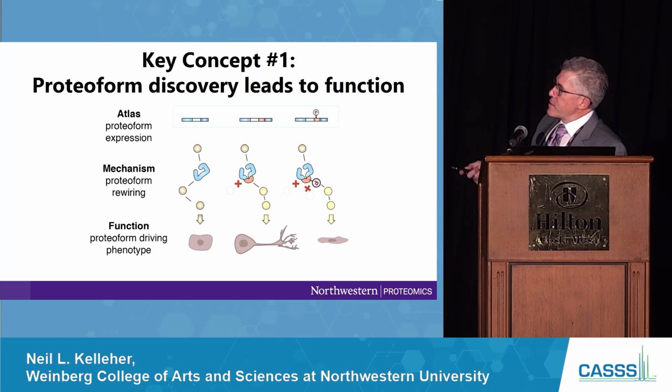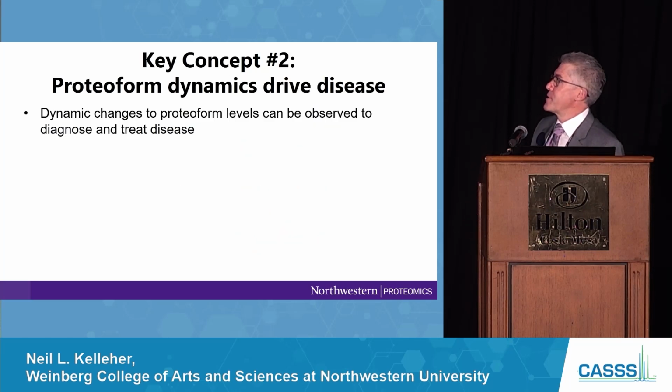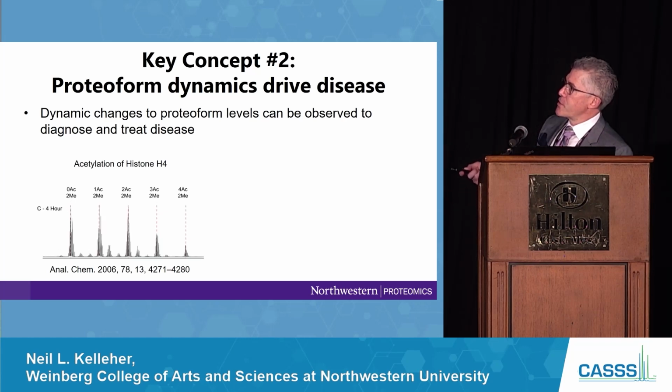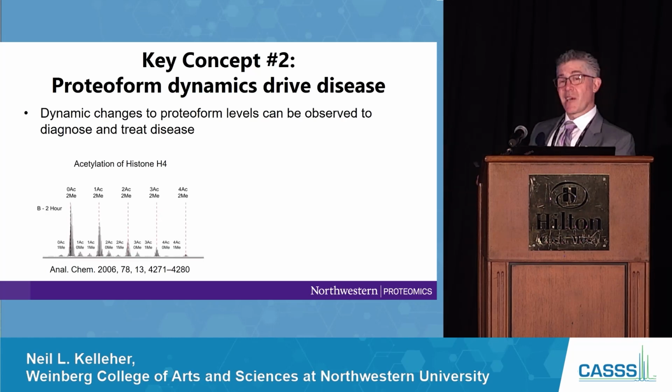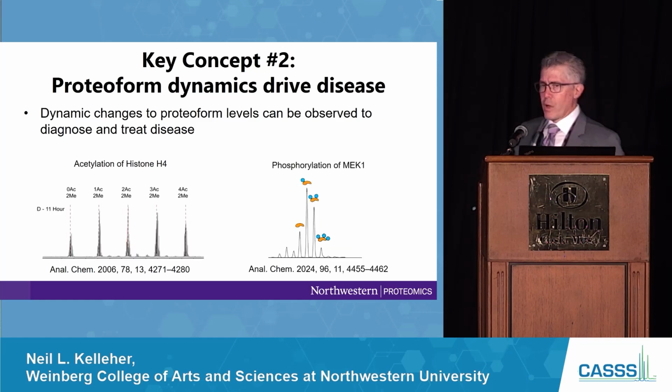But the idea is that if you can get that proteoform knowledge, it will correlate to function and phenotype very strongly, stronger than other types of molecular connectors that we have. That's my career, basically, in a soundbite. So here is, let me skip, histone H4 being treated with a deacetylase inhibitor, right? So now you're going to get 42 Dalton hyperacetylation, which is what you see in these intact mass spectra. And then there's some methylation patterns underneath here as well. But let me just go right to MEK1.